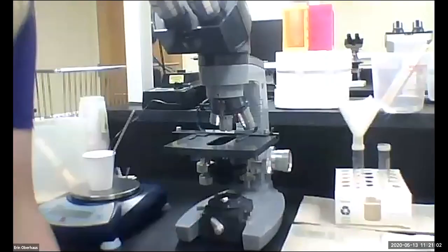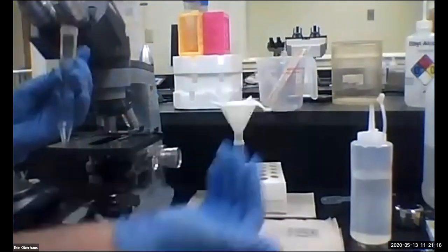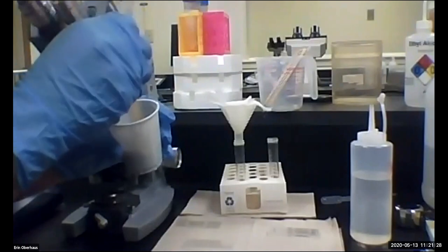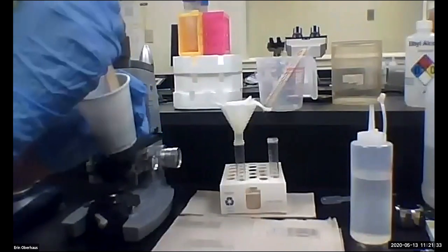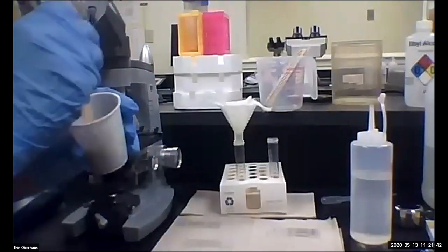All right, so these tubes are about 15 mils. You're really only kind of limited by the volume of the tube. Otherwise, when you go to strain it, and if you have a lot of excess, you're going to overflow the tube. So I'm going to dump that in here, and I'm going to create a nice poo slurry. That's my scientific term. It's trademarked. Nice poo slurry here, so it's nice and mixed and homogenized.